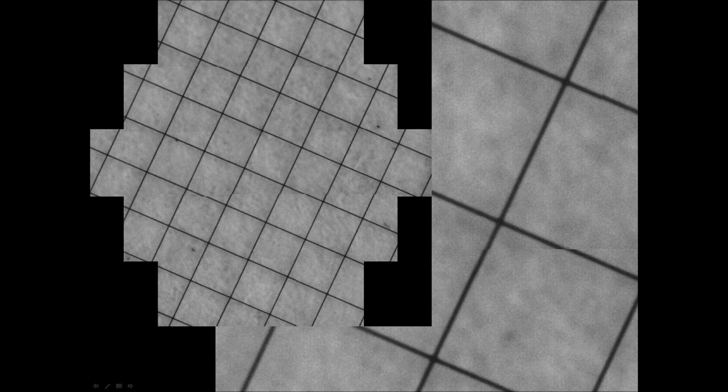This is another scan of another device we use for alignment. And the other part of the alignment you need is that the stage motion has to be square with the camera in order to get everything right. And so this is a grid which has got, these are half millimeter squares. And this is the mosaic where we have it so that they're, it matches up very well at the joints between these things. There's a little bit of mismatch here but that's, so that's something we do if the camera were not square with the stage there would be very ragged edges on these spots where the images join.